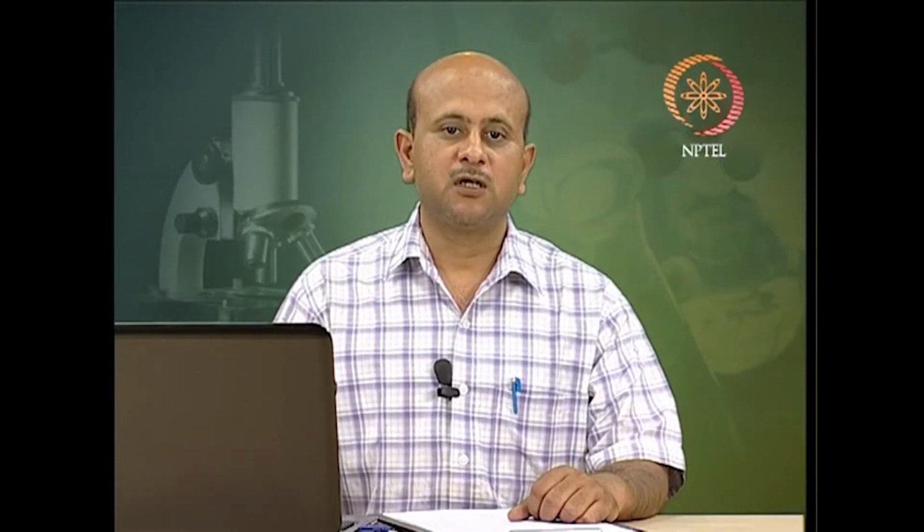Like we have already discussed different components, and some are common components, but there are certain additions here, like we have seen in DIC or polarization microscopy. Likewise, here the light source is with an excitation filter and the dichroic. So, the main components of a fluorescence microscope are a light source, which is a little different, like we will discuss; the excitation filter, that is the first optical filter; the dichroic mirror, which is also called a beam splitter; the objective lens; the emission filter; and a detector. Let us see each of them.